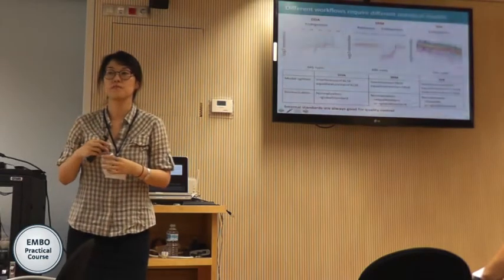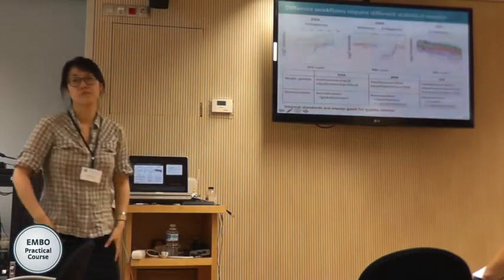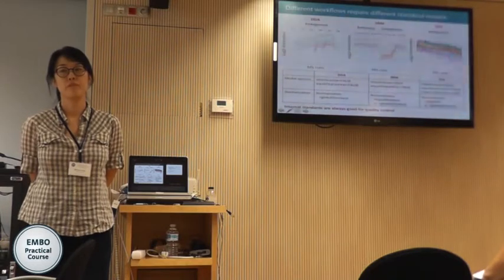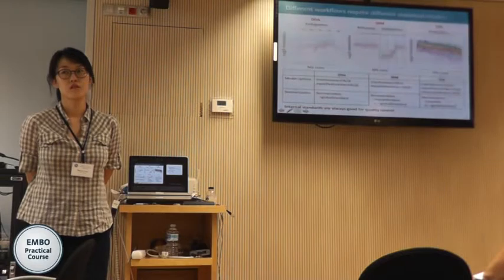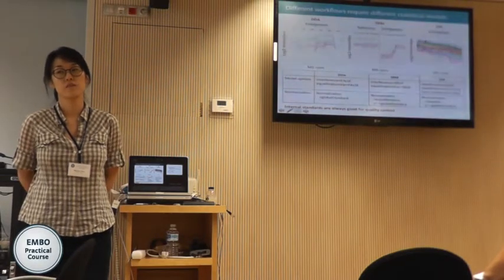Do you really prefer, also in DDA data, to use a global protein standard for normalization? And why do you do this? And wouldn't normalization also work very well if you have a data set where you assume that most of the proteins are not changing?